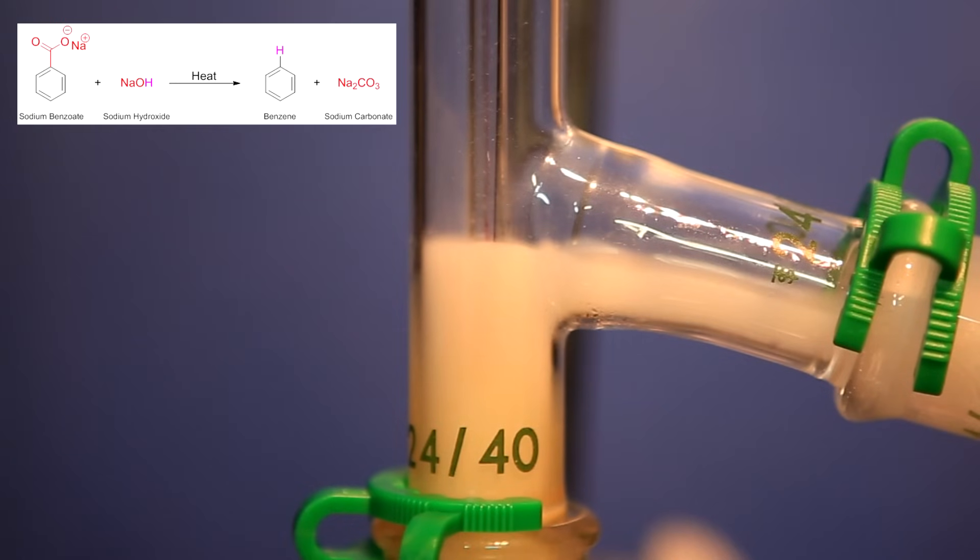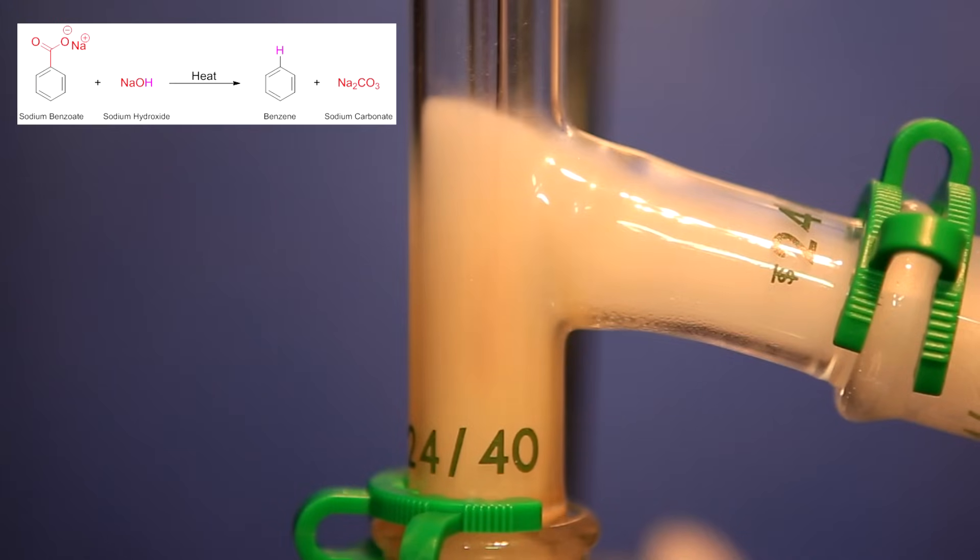In this reaction what's being carried out is known as a decarboxylation, and the overall reaction can be seen above. The reaction occurs between the sodium benzoate and the sodium hydroxide. With heat it produces benzene and sodium carbonate. The sodium carbonate is a salt and it stays in the can, and the benzene is boiled off. I've color coded some of the atoms so you can see where they end up in the final product.